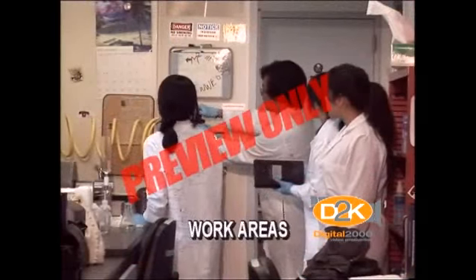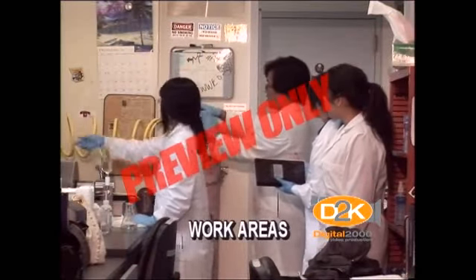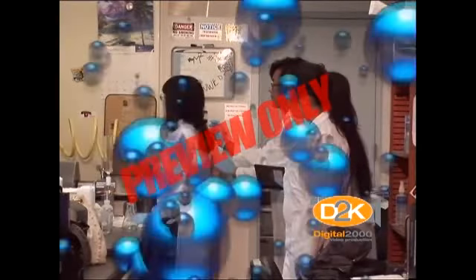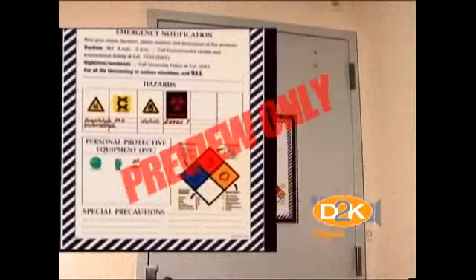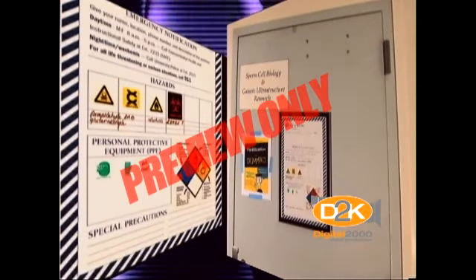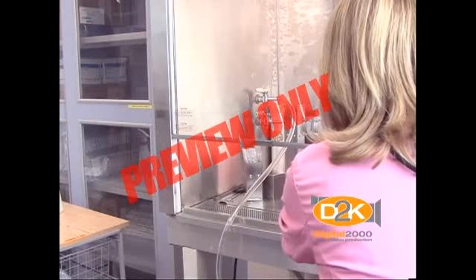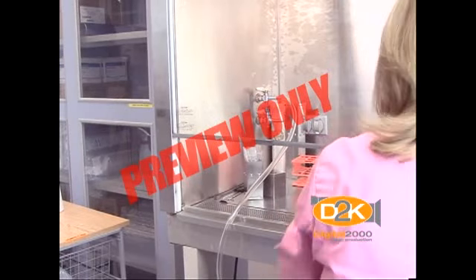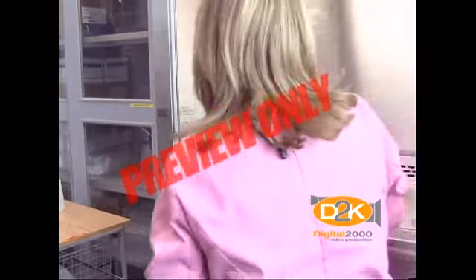Laboratory doors are to be kept shut and access limited when experiments involving biohazardous agents are in progress. Warning signs, which include the universal biohazard symbol and the approved bioassay or biosafety level for your laboratory, must be posted on laboratory doors. You must assure that all vacuum lines have a suitable filter and/or trap for biohazardous materials.